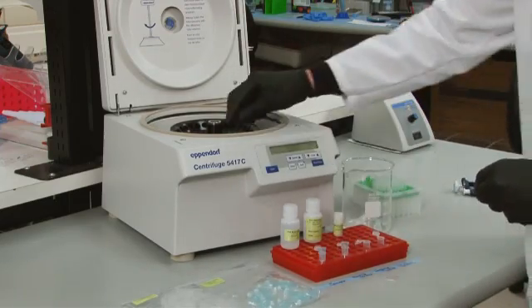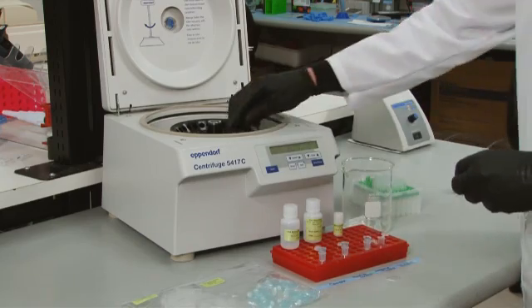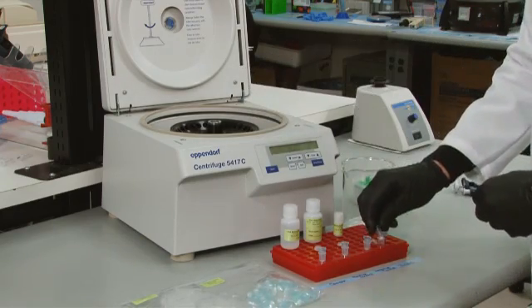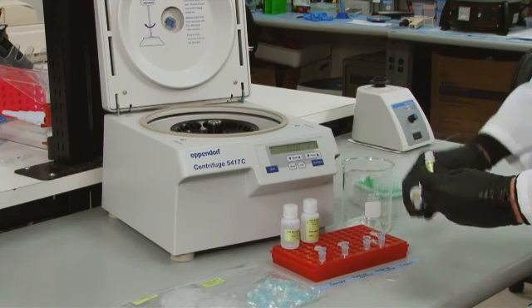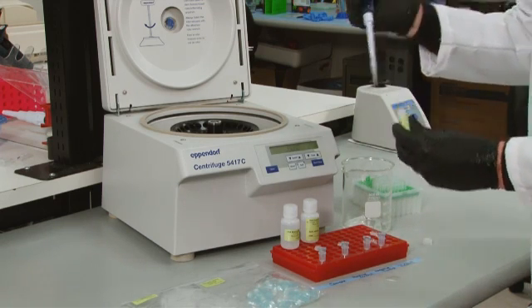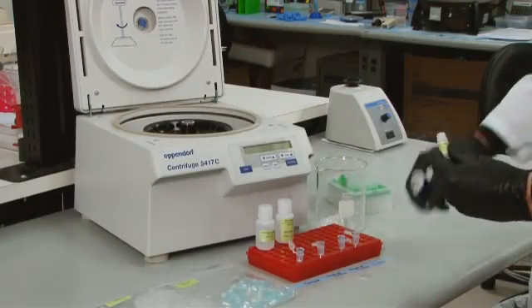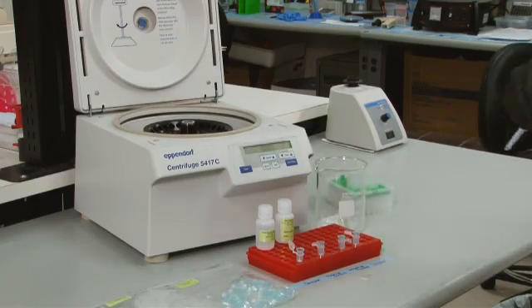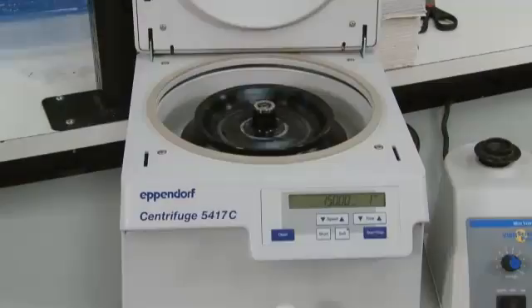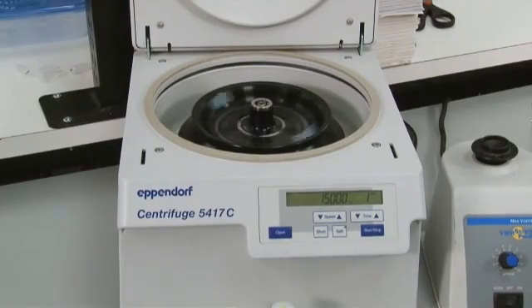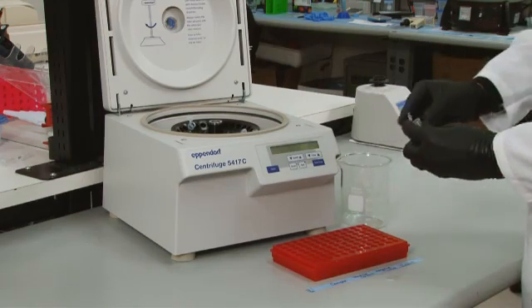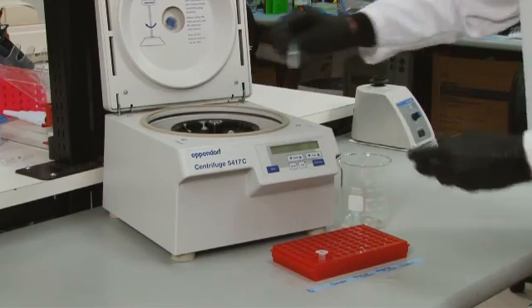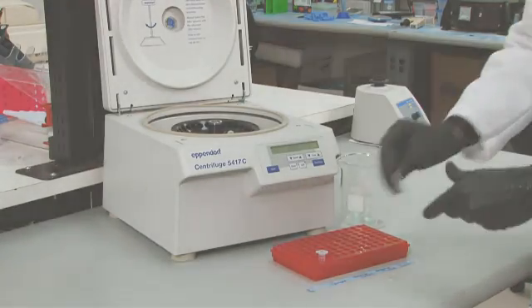Spin the empty columns at 15,000 G for 2 minutes to ensure that they are completely dry. Discard the old collection tube and place the purification column into a new, clean tube. Add 50 microliters of DNA elution buffer directly to the membrane in the column. Allow to sit for 1 minute. Then, perform a final spin at 15,000 G for 1 minute. Discard the purification column and save the purified DNA at minus 20 degrees Celsius until ready for the last phase.